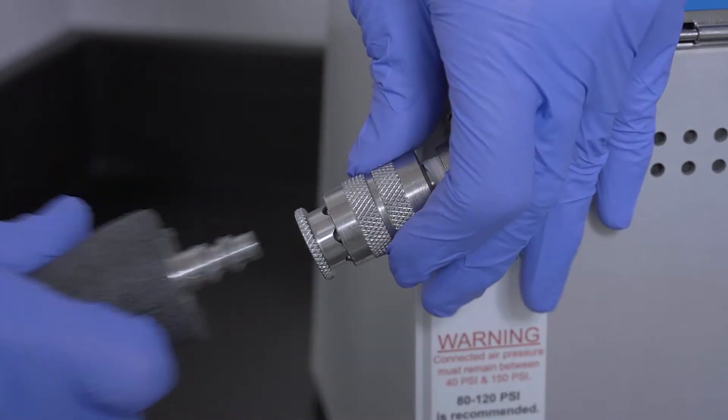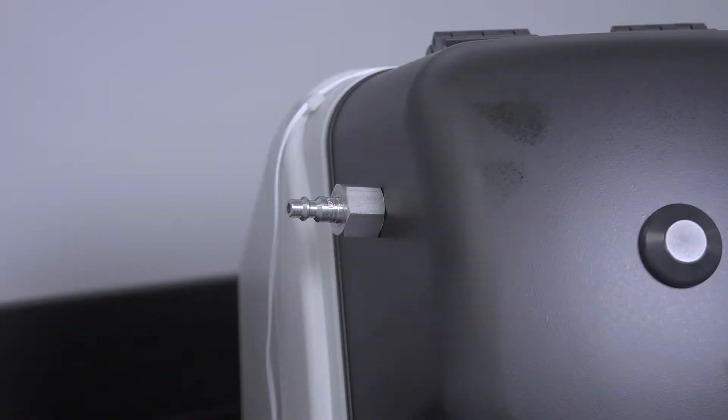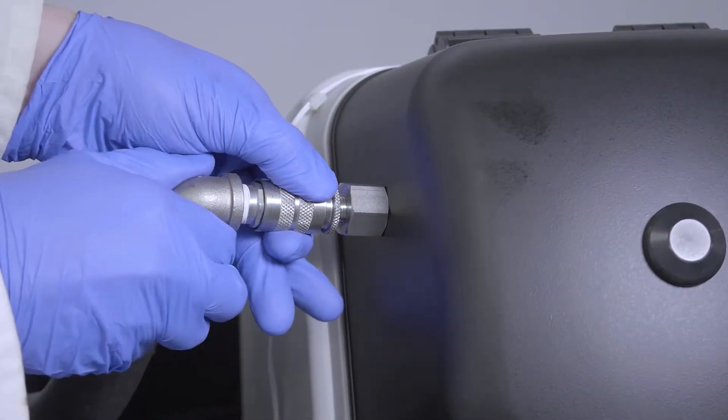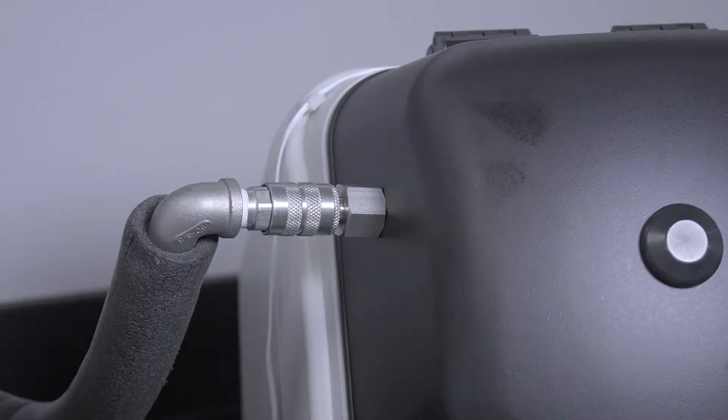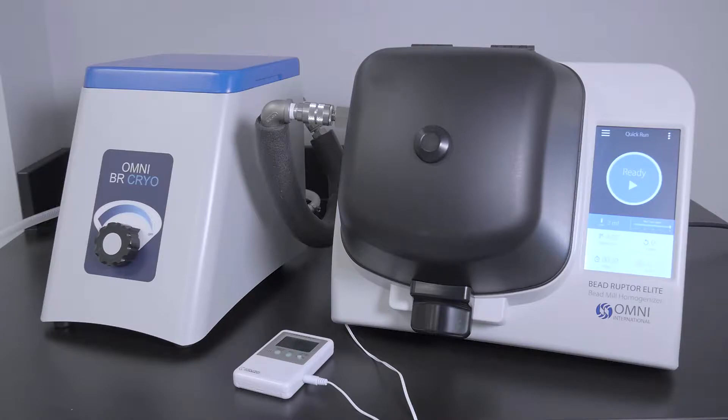Connect the straight end of the insulated cryo hose to the BeR Cryo unit. Connect the elbow end of the cryo hose to the BeadRuptor lid. The BeR Cryo unit is now ready for cooling.